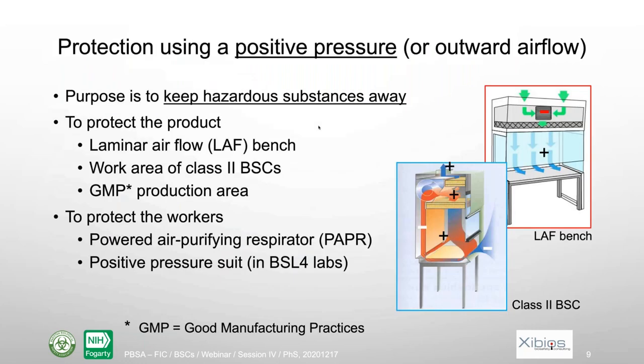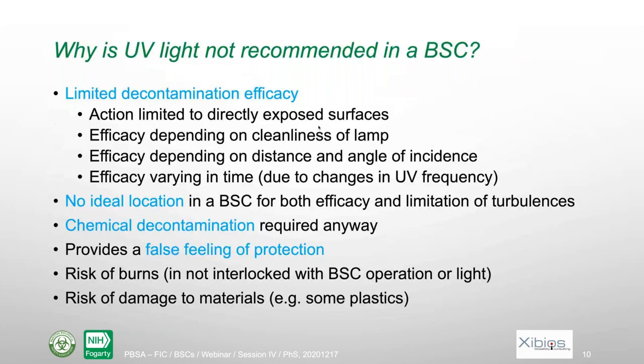Also, the efficacy depends on the cleanliness of the lamp, on the distance between the lamp and the object, and also the angle of incidence. And also it varies over time. That means that we need to change the lamp, because the UV frequency changes with time. Also, there is no ideal location in a biosafety cabinet. If you put it too high, it will be less efficient. If it's too close, it will only touch a small part of the biosafety cabinet.